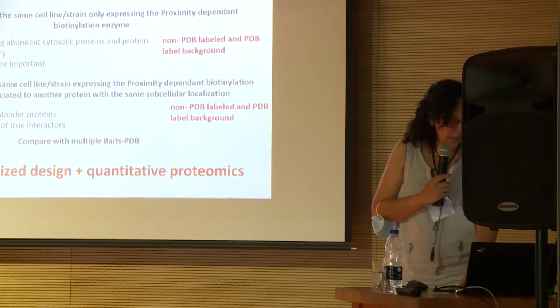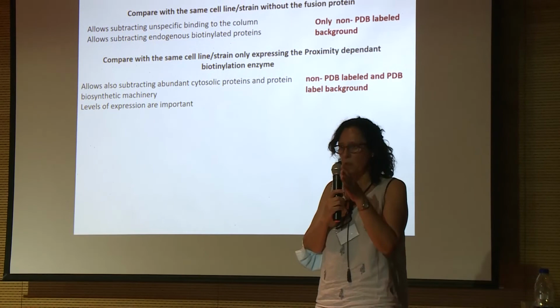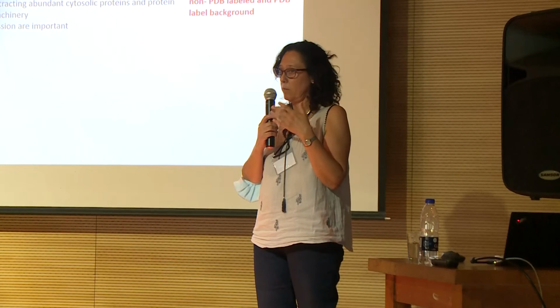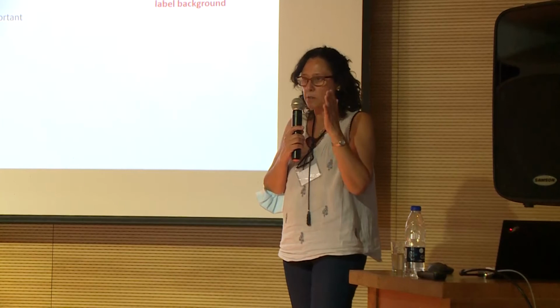For BioID, the radius was calculated based on the known structure of the nuclear pore. So they performed the experiment and they have the structure, so they calculate the radius. I'm not sure this can be extrapolated to all the systems. Maybe I would say no. But this is the best calculation made.